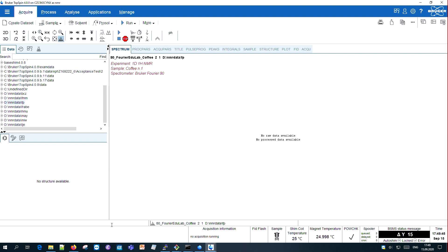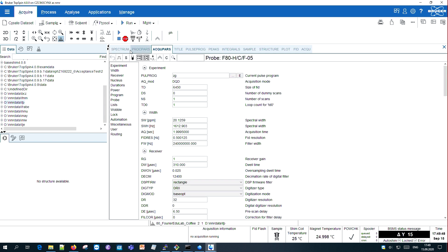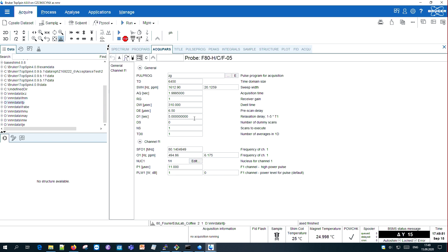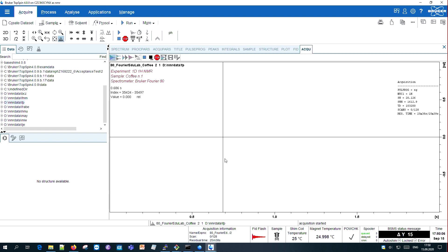How to set up experiments is perfectly described in our step-by-step protocols. And now everything we need to do is to wait for the end of the experiment.